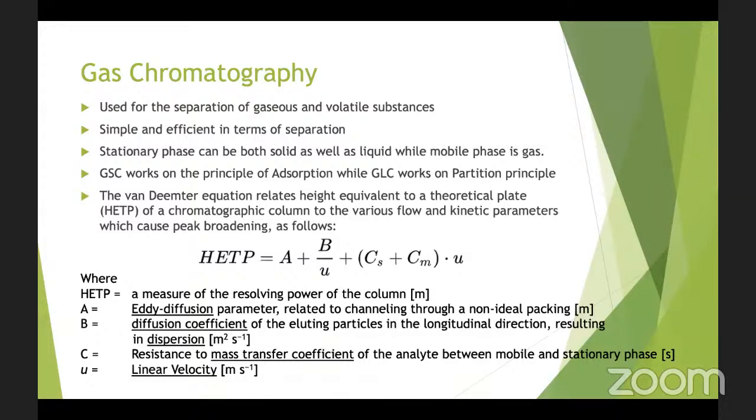For example, in a column plate filled with a stationary phase of varying sizes, a single analyte will have different path lengths due to the different paths available to the same molecule because of interparticle spaces. Where there are bigger particles, there will be a different space. When it goes through smaller or minute particles, then it has a different space. Thus, it will cause peak broadening. Though this does not occur in the case of gas chromatography, as gas always tends to choose the shortest path.